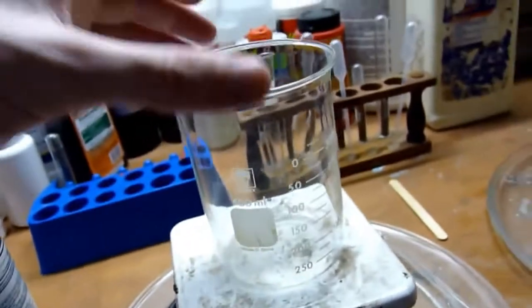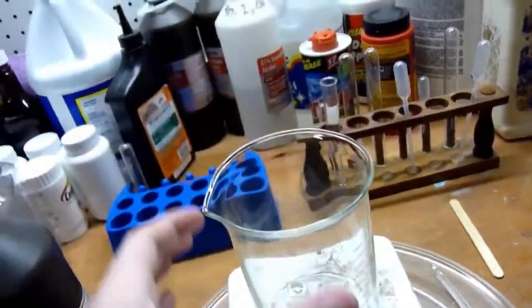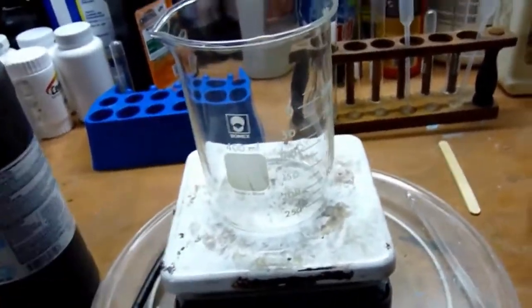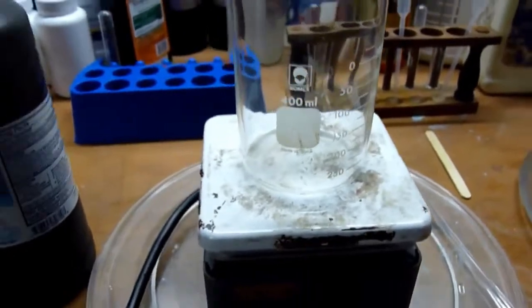You also want it to be as wide-mouthed as possible, because the more surface area you have of the liquid, the more evaporation you're going to get. So this is my widest beaker, and my hot plate's not much bigger, so that kind of works out.